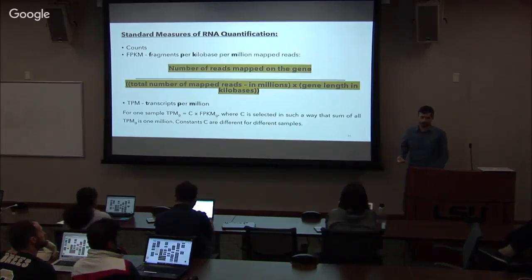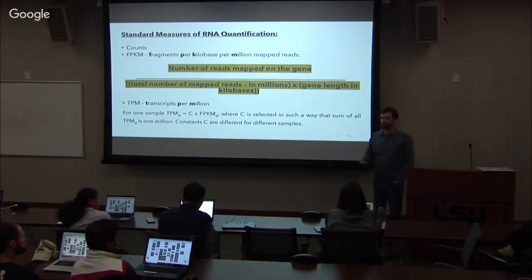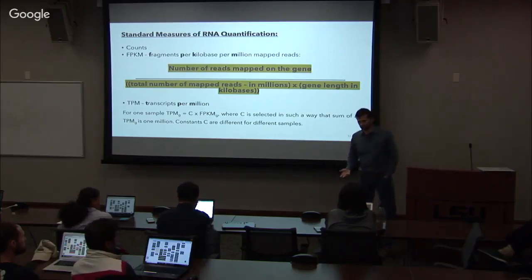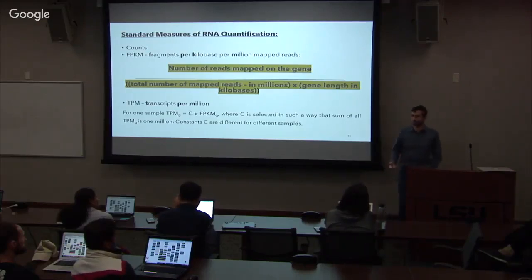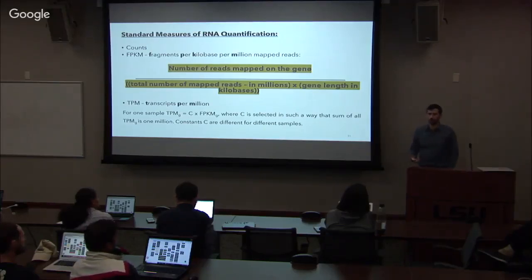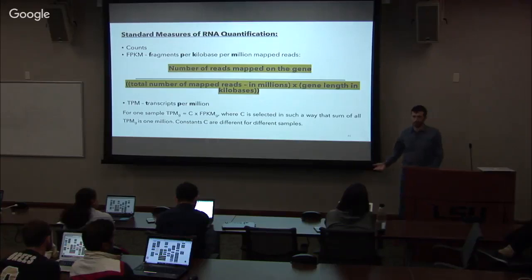Yeah, so the idea is that you can compare. There are many papers that do comparisons between how well they perform, and they seem to be performing for different tasks a little bit differently. So a lot of people, for example, utilize STAR when they're interested in gene fusion. BWA and Bowtie are different algorithms that do the same thing, and it's been kind of shown that Bowtie is more accurate. But still they are widely used for all the same kinds of studies.